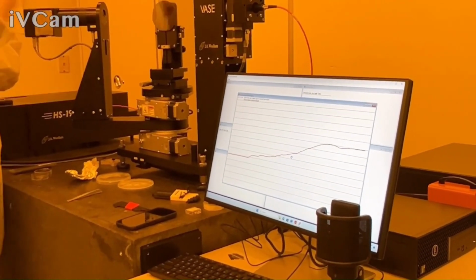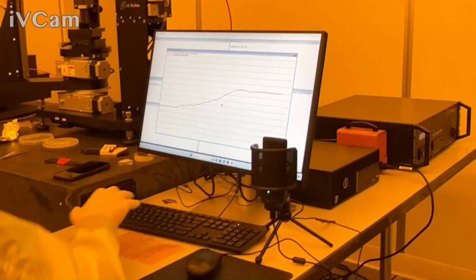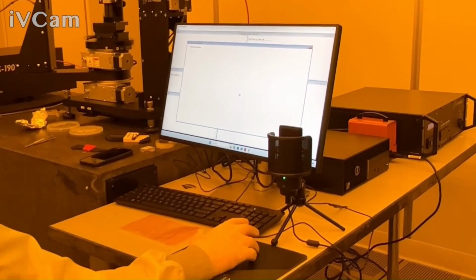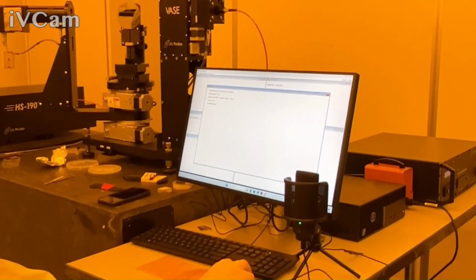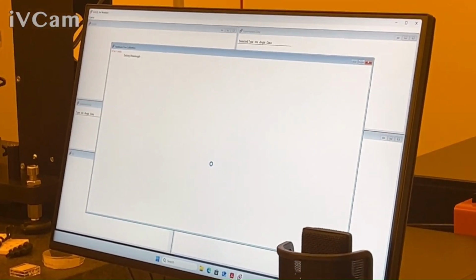Okay. Good deal? Yep. Okay, so also escape and continue. And now that we are aligned, now we can calibrate. So now we go ahead and acquire data, calibrate. Yes, and the settings are fine. So it'll take a few minutes.